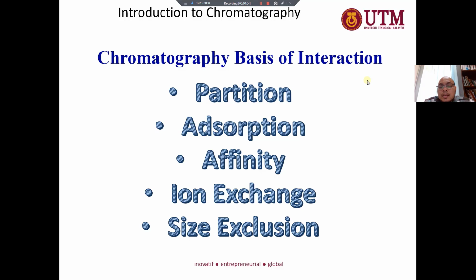Okay, let's go to the chromatography basis of interaction. We have five basic interactions of separation. The first one is partition, and then we will learn about adsorption, and then the affinity interaction, before we go into ion exchange, and finally we will learn about size exclusion interaction.